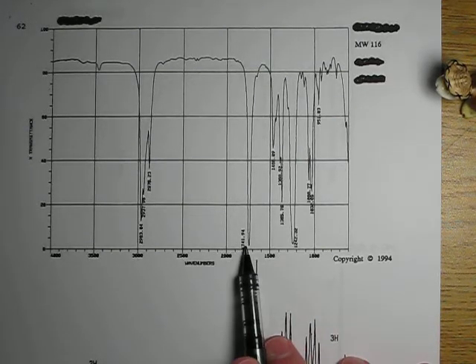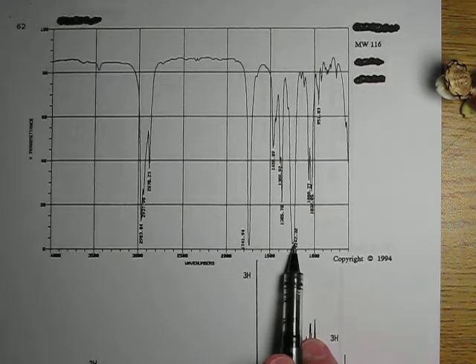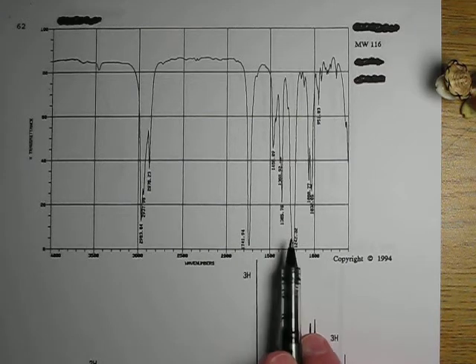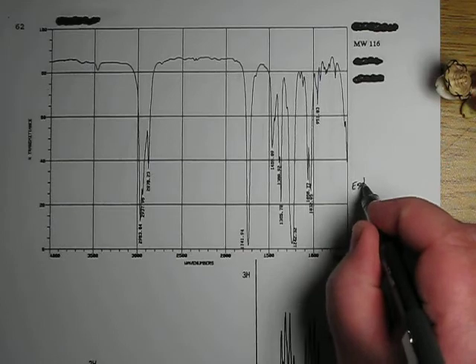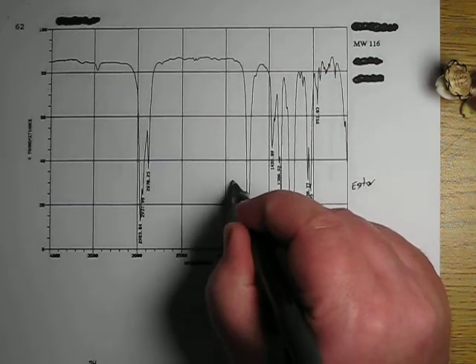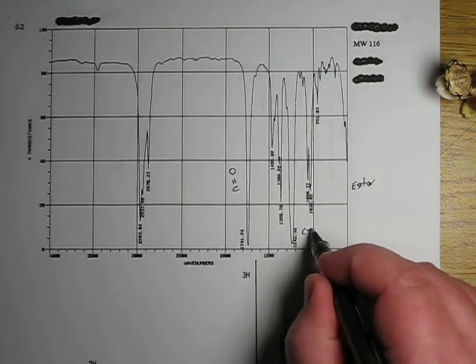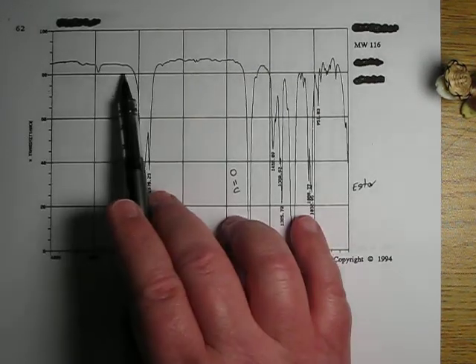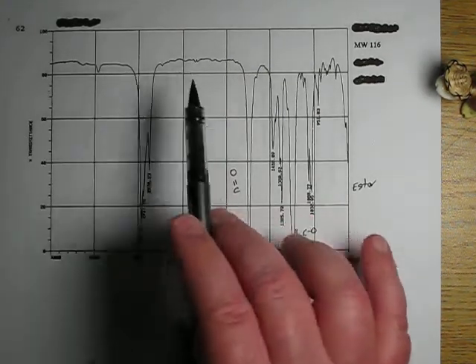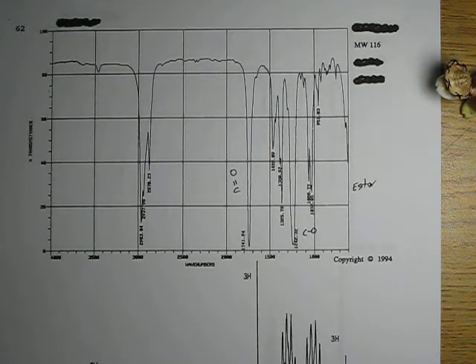I'm seeing carbonyl. I'm seeing another peak right here that's about the same, that's also wide and about the same length. This is screaming ester at me again. I should have a carbonyl, and this is the carbon single bond oxygen of an ester, and I'm not seeing anything else there. I don't see any double bonds or anything like that, nothing crazy. No benzene rings, so I'm looking at another ester is what I'm thinking here.